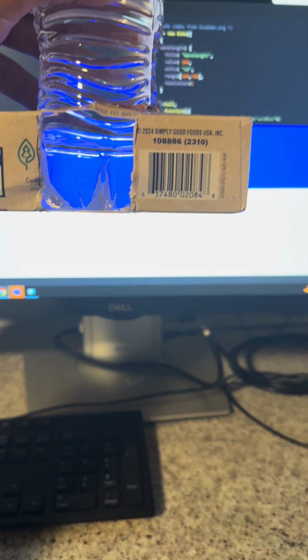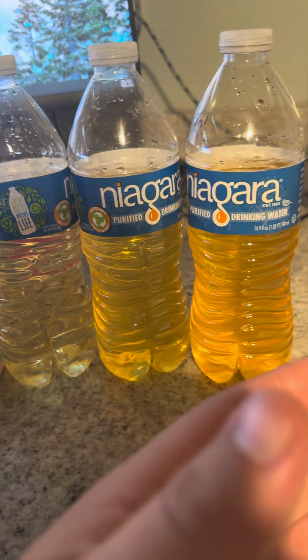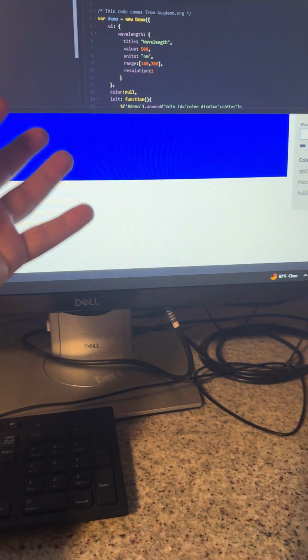Then I utilized the colorimeter app to shine through. I had to sort of stabilize my phone for this setup, but to shine through each sample to observe the blue light, and measured the blue and green values. Green here is not necessarily being measured in my later math, but I wanted to note it to make sure that I was doing things right, which makes sense.